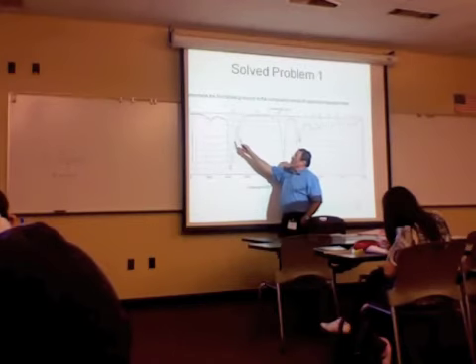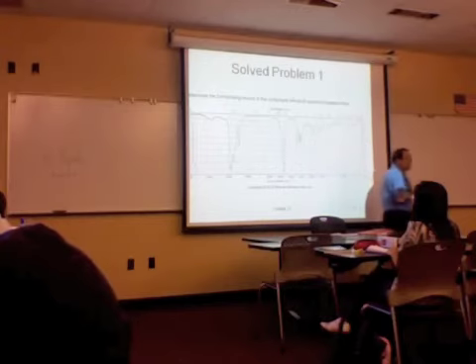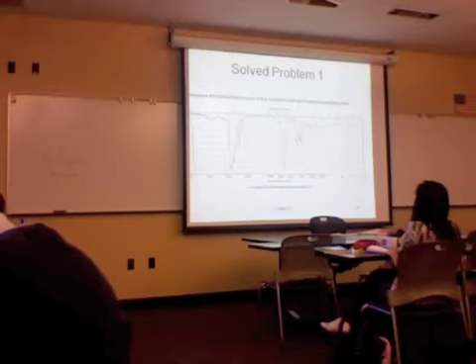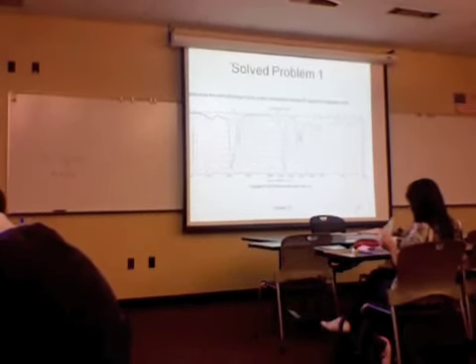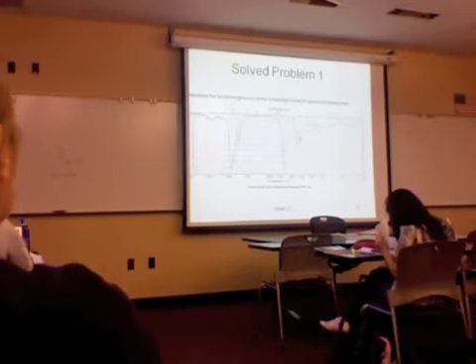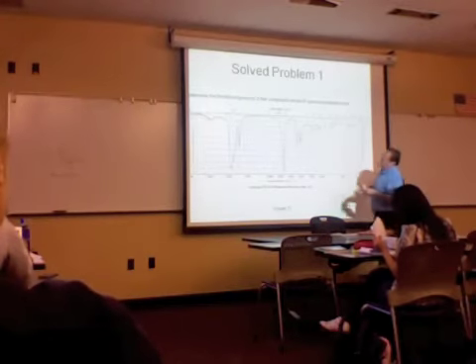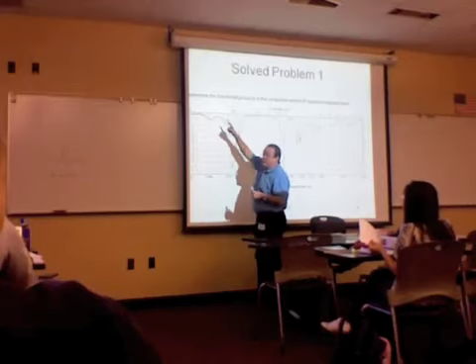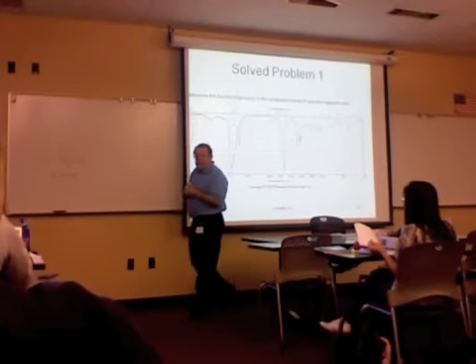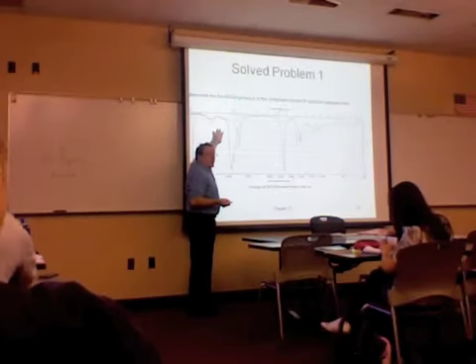And we see its little overtone up here, which we've seen before. It's not an alcohol, it's an overtone of the intense carbonyl. So we know, based on the structures we've seen, we can narrow it down to either ketone, aldehyde, carboxylic acid, or an amide. We know that there are other features we can look for to identify those things. So, we don't see the big, broad band here associated with the carboxylic acid. And we don't see anything out here that suggests an amide.